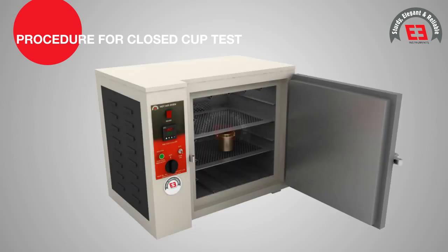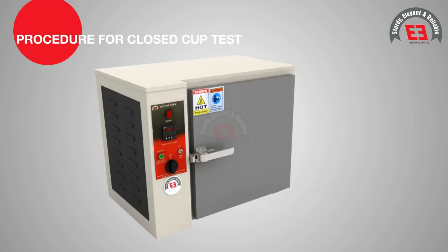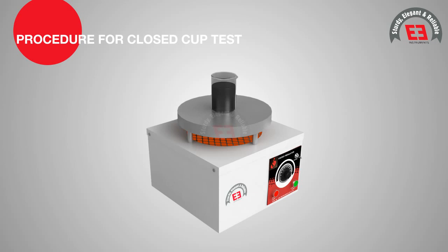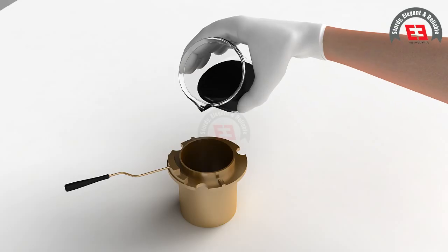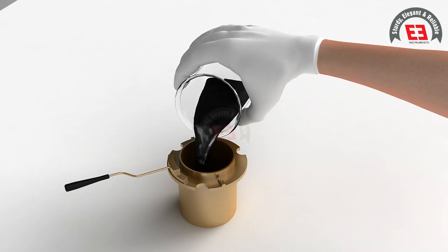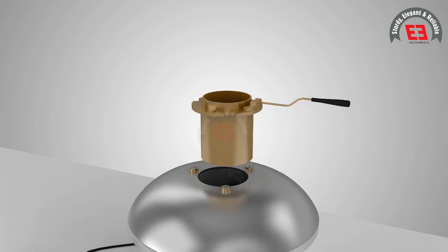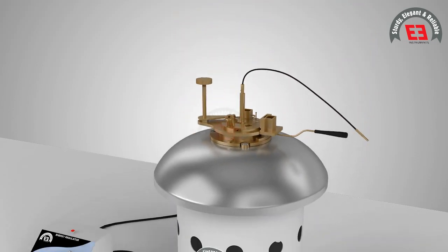Procedure for Close Cup Test: All parts of the Close Cup Tester are cleaned and dried in hot air oven. The bituminous binder is heated well above its softening point and filled in the cup up to the filling mark. The lid is placed to close the cup and heating unit is started.